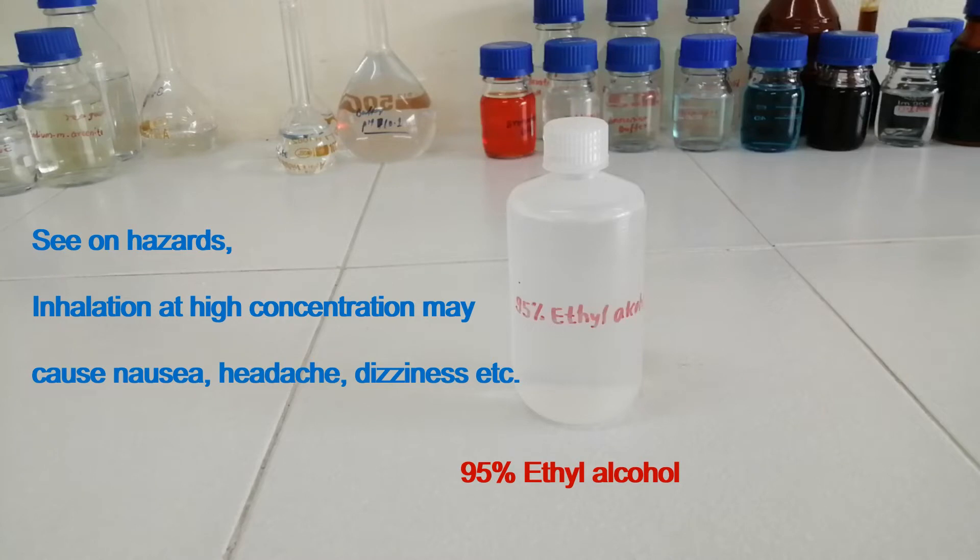This is 95% ethyl alcohol. Inhalation at high concentration may cause nausea, headache, dizziness, etc.